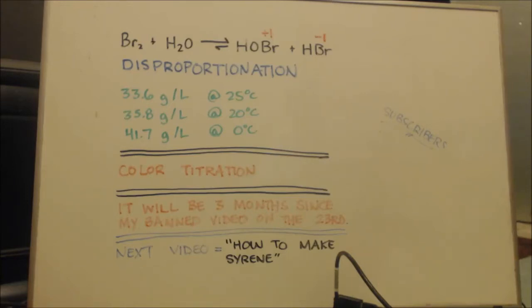Now, if you saw my bromine video, you've seen that there were clumps of, I don't know if it's polymerized bromine, or maybe it's a combination of bromine and chlorine that polymerized, made some oligomers or trimers, dimers, whatever. I don't know what it was. I didn't get it out. I just dumped it all into the water, as you'll see. So I don't know exactly. I know there was 40 milliliters of bromine there, but there was a little bit of water in there. Not enough to form two layers, but still there was some water in there, and there were the solids.